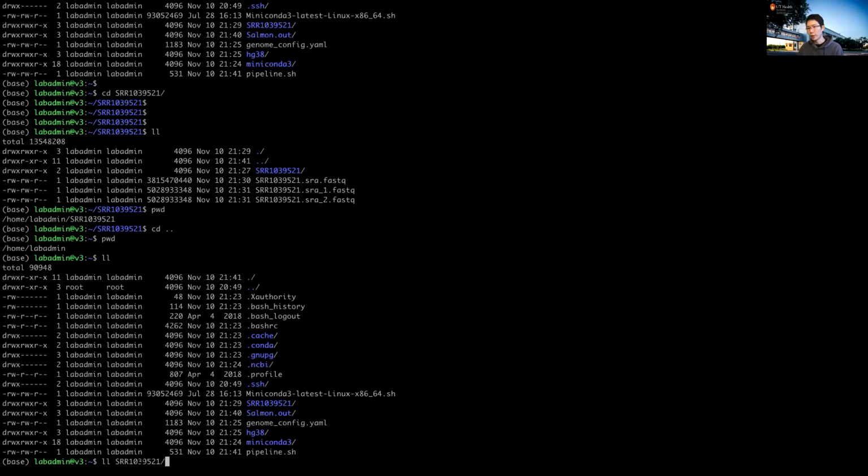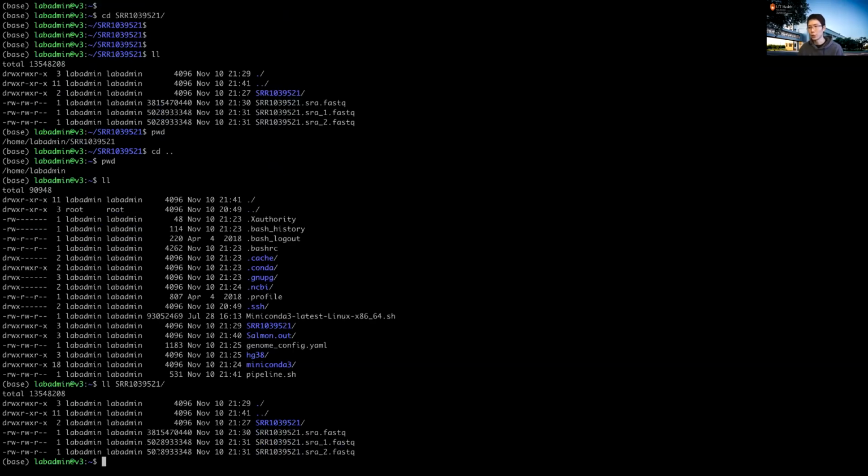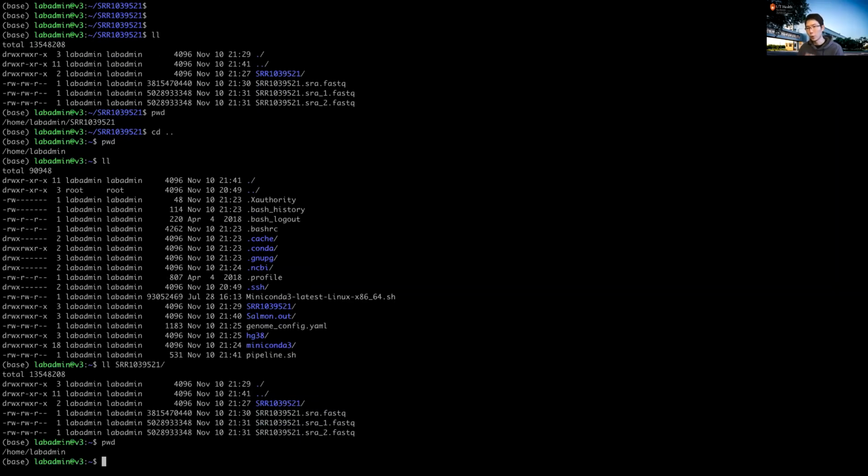But if you do ll and this folder, you pretty much list all the contents within it, and we are still in our original directory. We are not entering this. So it's sort of a preview, I would say preview mode. So you can look at the contents.